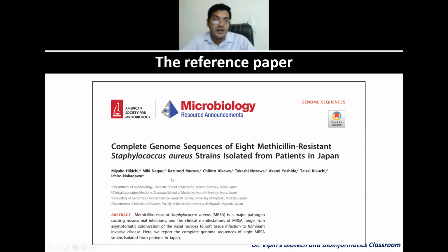This is a paper that had come recently. Basically, we take this data because it is simple to explain. I don't want to lead you into a very complicated analysis the first day itself you come to Galaxy, because then some of you would be put off so much that you may not use it at all. So we take a simple data set of 8 methicillin-resistant Staphylococcus aureus strains, and that is what we're going to analyze.